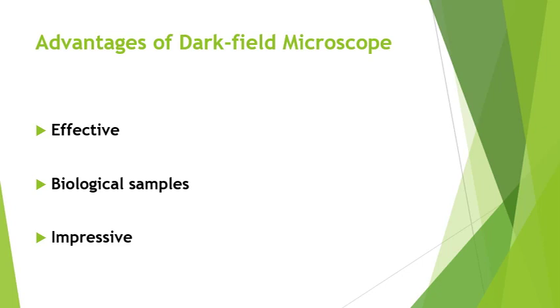This microscope provides very good results, especially in the examination of various biological samples like blood. It can yield high magnification of different bacterial cells and low magnification of tissues and cells of certain organisms. Through this microscope, certain bacteria and fungi can be studied by using its principle of working.